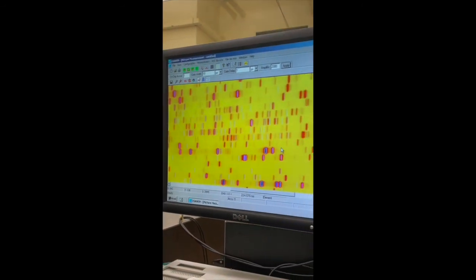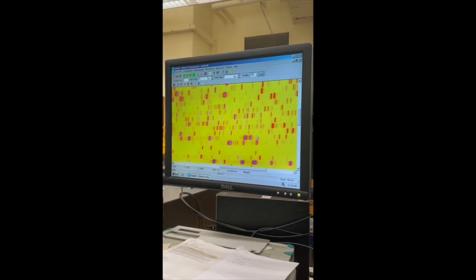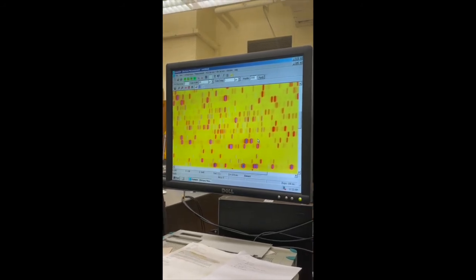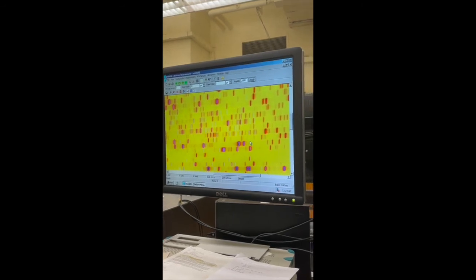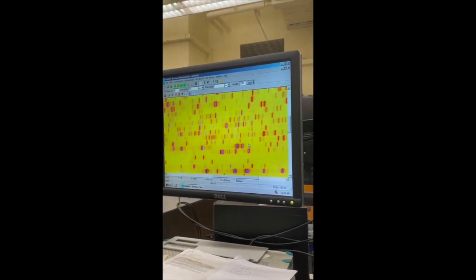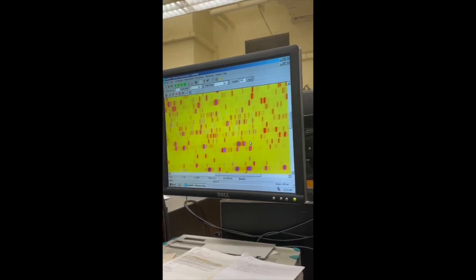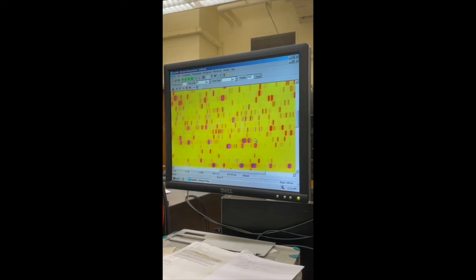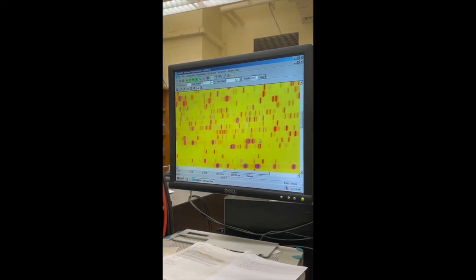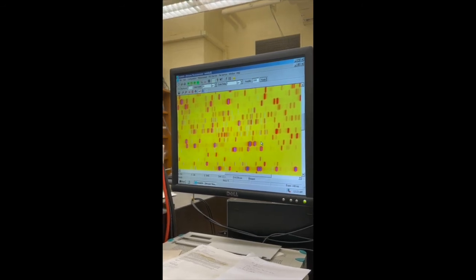So this picture window is actually showing you what the camera measured. There's a very sensitive CCD camera inside our spectrometer, and it's 1024 by 1024 pixels, and this is what all those pixels are looking at. The blue lines are where each of those emission lines should be, and of course the colored dots is where it saw diffracted light off your Echelle diffraction grating.